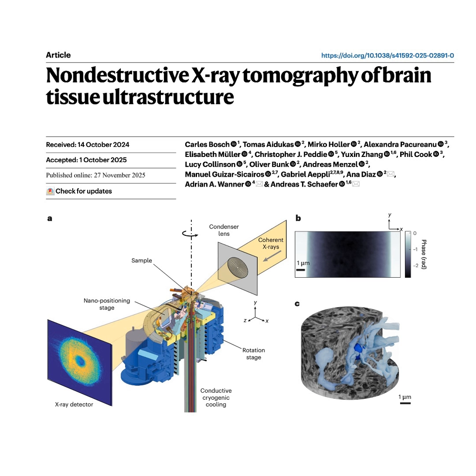That's a fantastic analogy. The algorithm then looks at these subtomograms and it estimates the deformation fields, the exact 3D movement or optical flow between those snapshots. And then it can computationally reverse the warp. It can. It compensates for the movement caused by the radiation over time, and it fuses all that corrected data into one final crisp image. That's brilliant. It's like the image stabilization on a modern camera, but for high-dose X-ray physics.